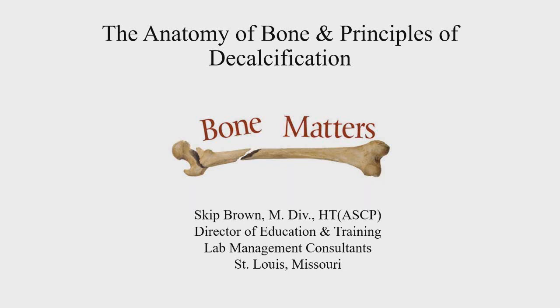When I sent the abstract in, I basically just talked about the diversity in different tissues that we have and the various types, whether you're working in human or veterinary or even plant research. But bone specimens, whether human or veterinary, require special knowledge and understanding, particularly in the handling process, before you can even think about preparing it for visual examination or diagnosis.